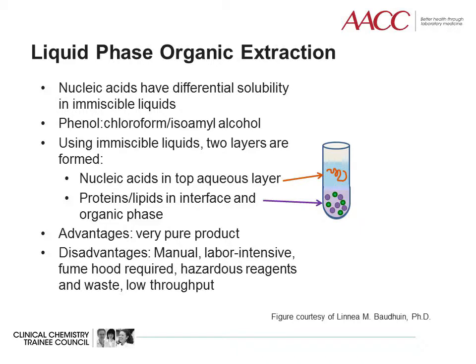Liquid phase organic extraction is a common method used for nucleic acid isolation that leads to a very pure product. Nucleic acids can be isolated from other molecules because of their differential solubility in immiscible liquids. Phenol mixed with chloroform and isoamyl alcohol is the most common reagent for liquid phase organic extraction. Phenol denatures proteins, whereas the chloroform and isoamyl alcohol help separate the phases and prevent foaming. Two layers are formed, with the top aqueous layer containing the DNA and the bottom organic layer containing proteins and lipids.